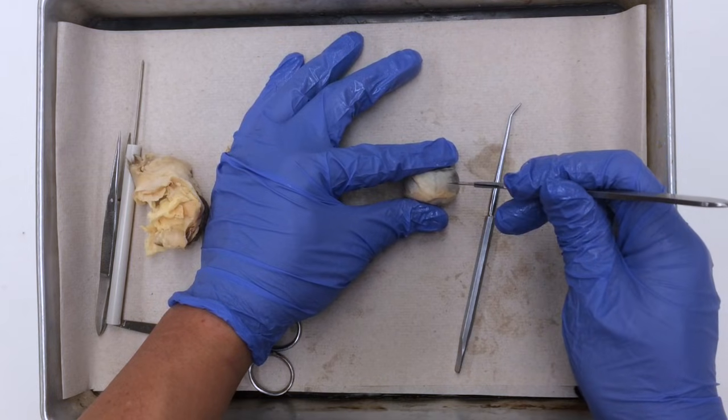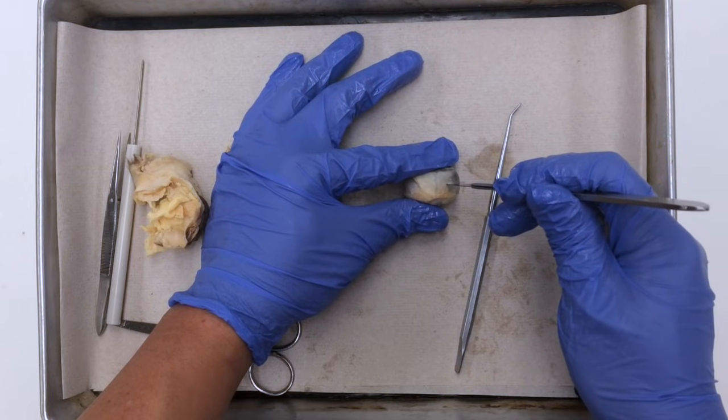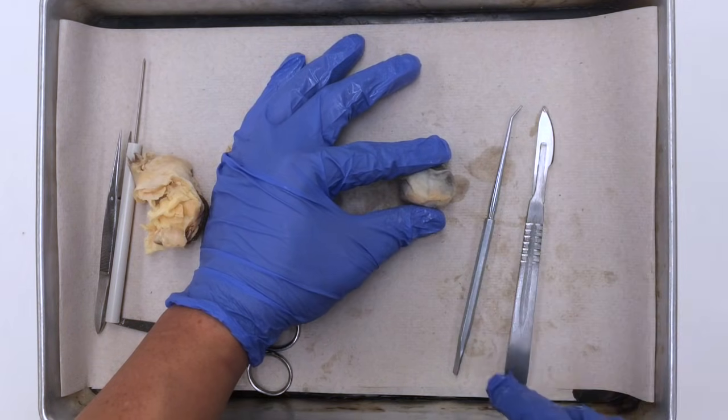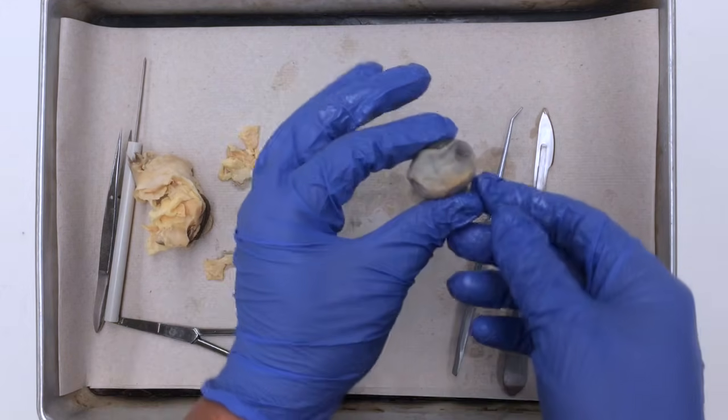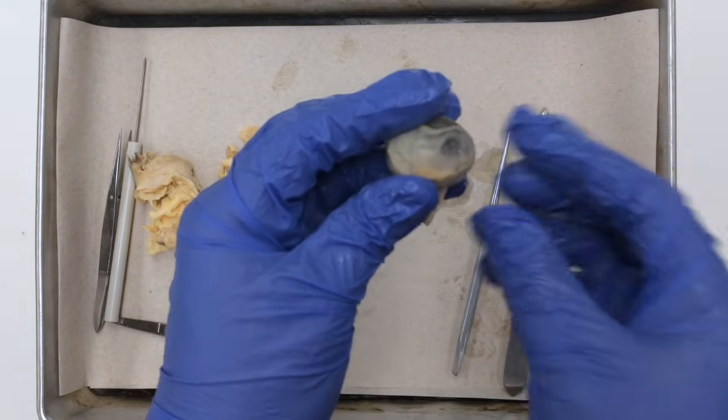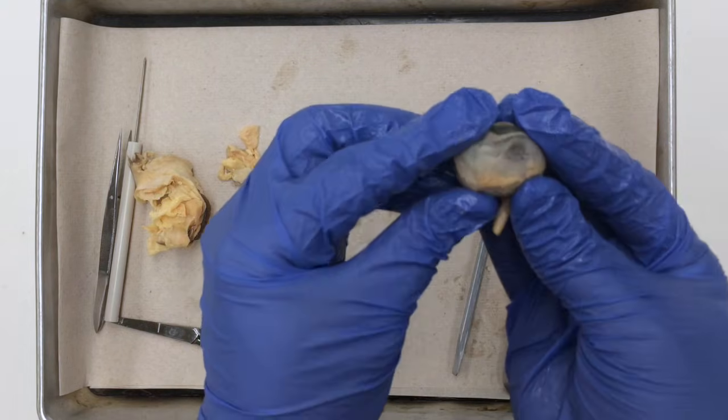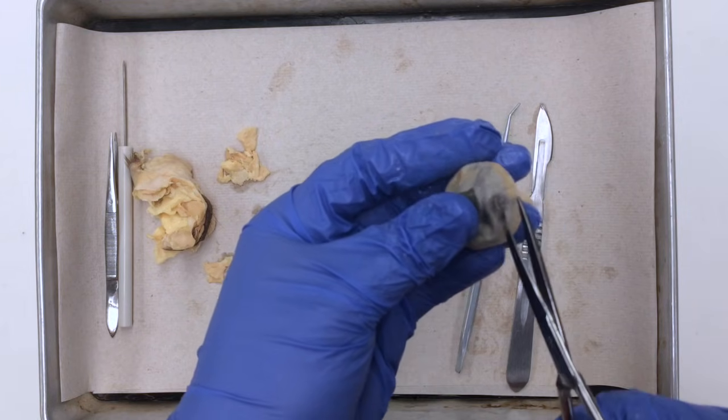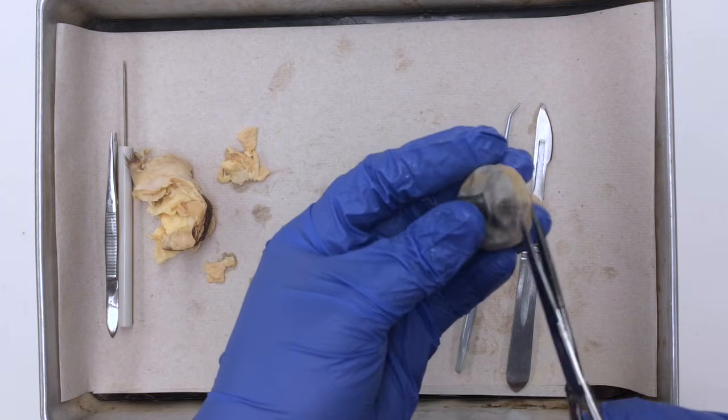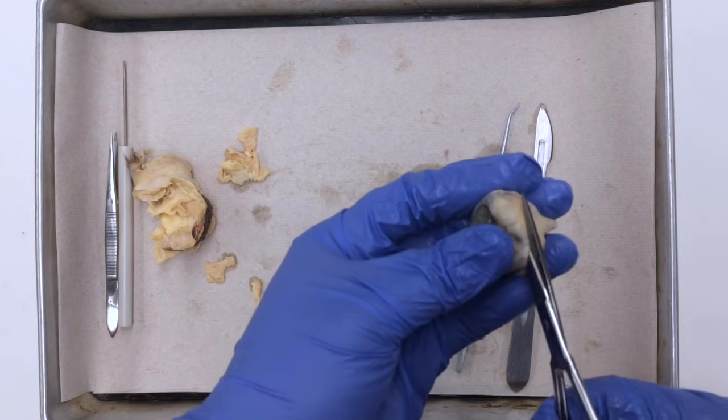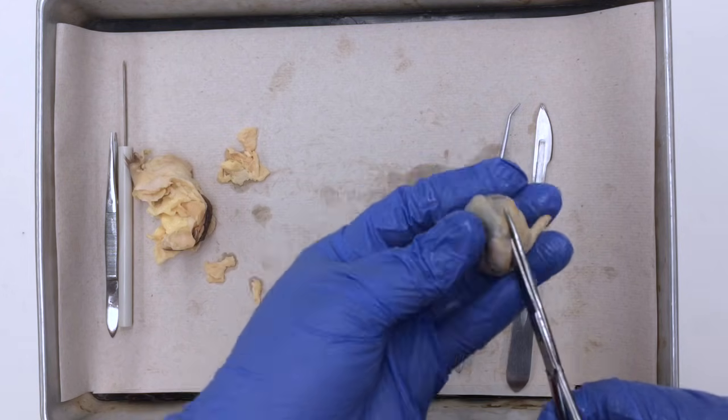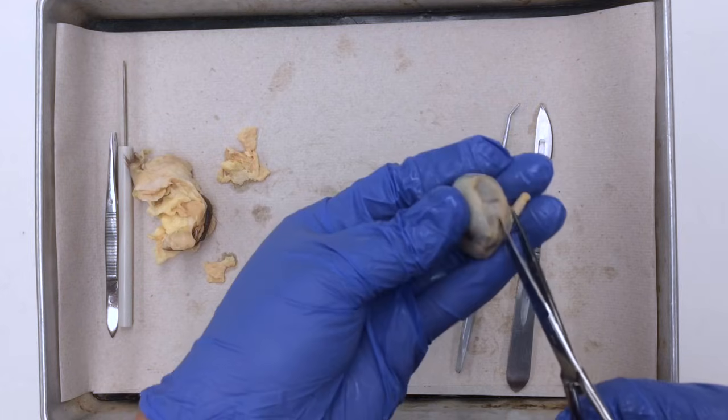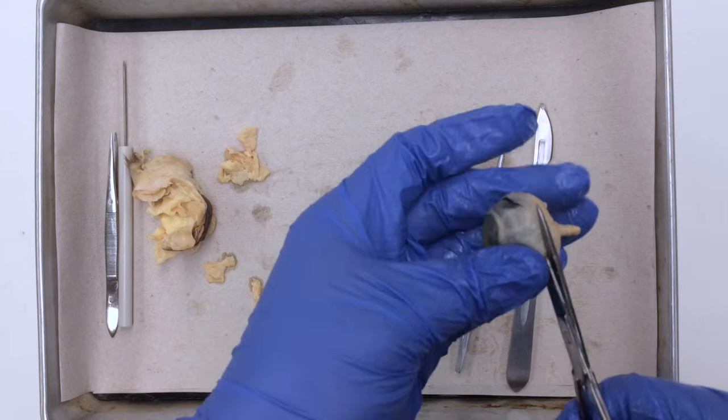Gently make an incision with the tip of the scalpel, and you're going to notice there's a lot of fluid oozing from the eyeball. That fluid is nothing more than the fluid that was preserving the eyeball, as well as some of the fluids which are normally found within the chambers of the eye. Cutting along the coronal plane of the eyeball, I'm going to split the eyeball into two halves, an anterior half and a posterior half.